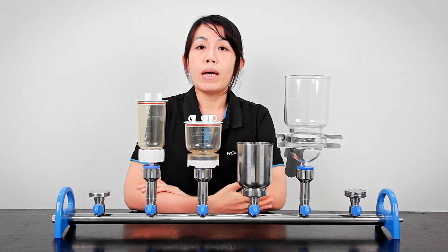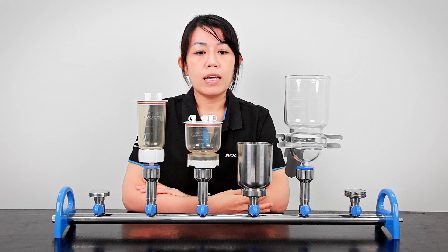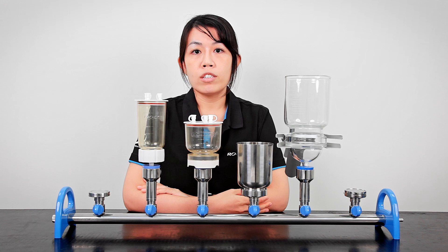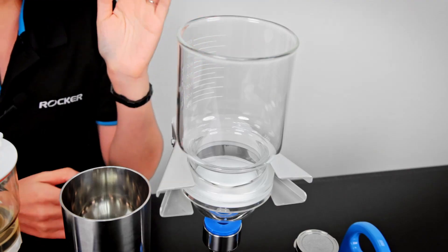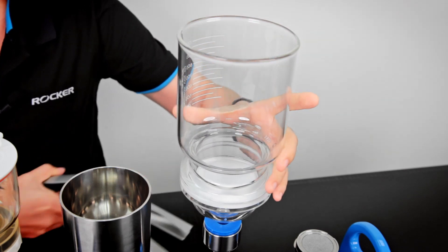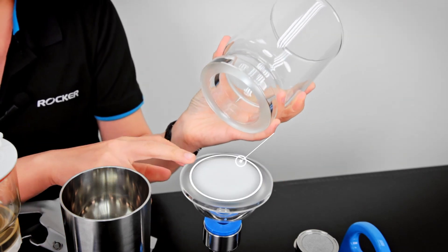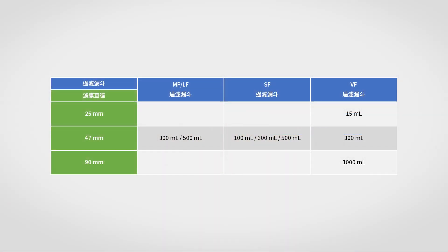For larger capacity, in order to increase the efficiency of filtration, holders are usually designed to hold a larger membrane. For example, in Rucker, our VF 1000 ml filter holders can hold up to 90 millimeter diameter filters. We've made a table to show you the capacity and diameter options of each collection.